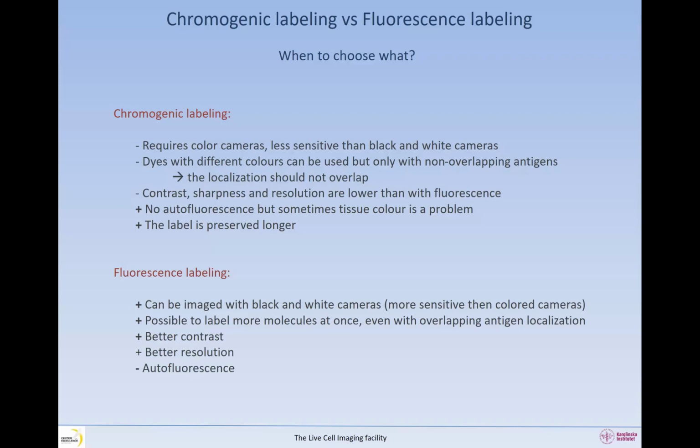And you will have to deal with it during your immunostaining. Also, you have a risk of bleed through between your fluorescent dyes, which of course we know by now that you will choose fluorescent dyes so you can avoid as much as possible. You will avoid bleed through. And another disadvantage is that the fluorescent dyes can fade during imaging and during storage.